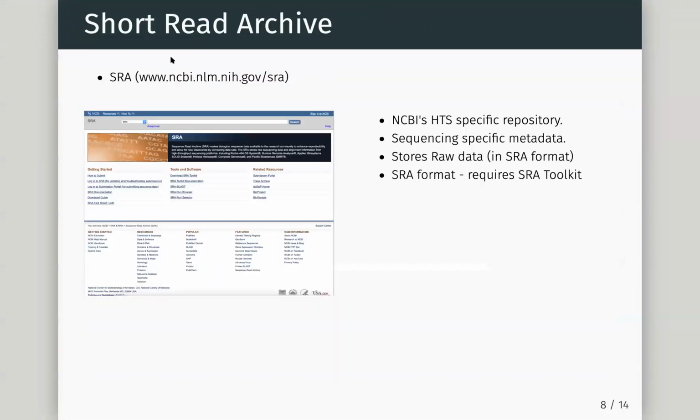It will pass it to its partner, which is the short read archive. So this is SRA. So SRA, by its very name, is built for short reads. The Fastq data we get from Illumina, actually, they have their own problem now because short read isn't really going to cover enough. There are long read technologies. If we're lucky, we'll be able to get Olivier to come in and give a little intro on that. But these include things like PacBio. SRA is trying to now include them too. So they have a similar problem. They're updating. They want to be something they didn't originally set out to be. But who doesn't want to be that?